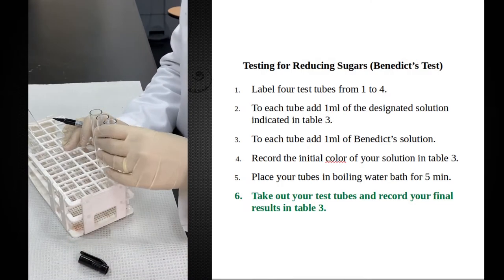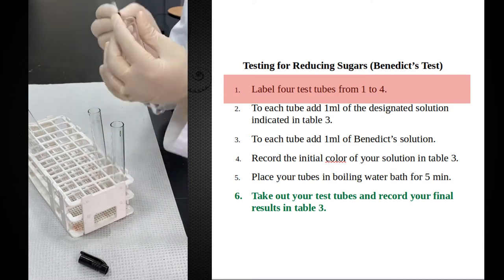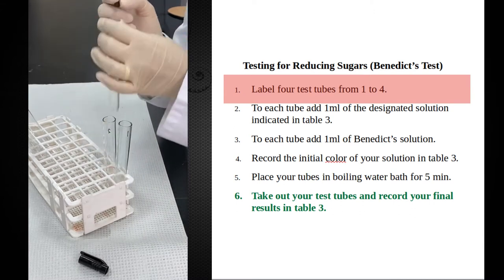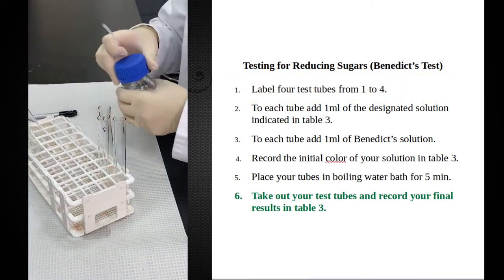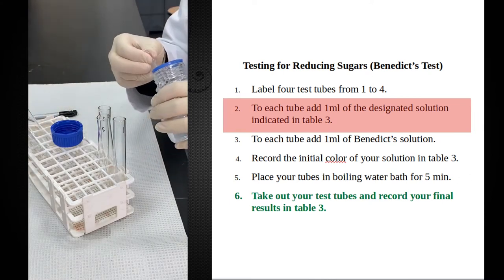Now we are going to perform Benedict's test. Benedict's test is a test for reducing sugar. I will use three test tubes. The first test tube is going to be my negative control and I will add in it one ml of distilled water.